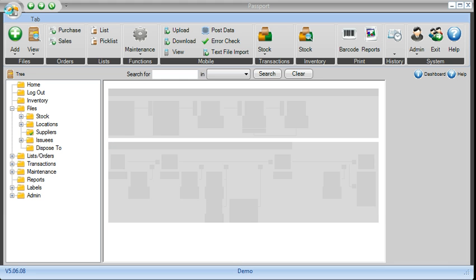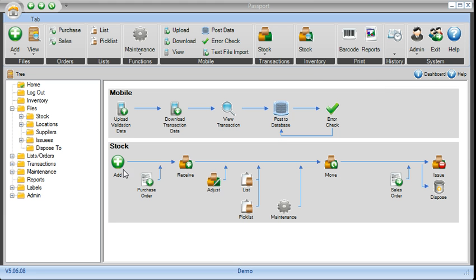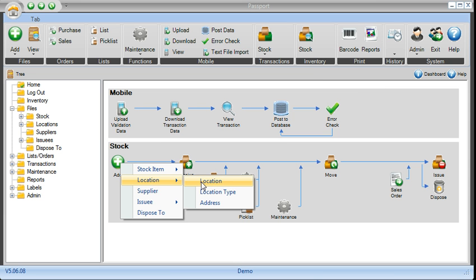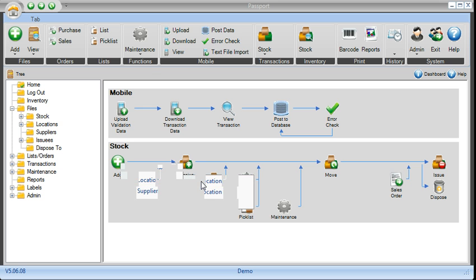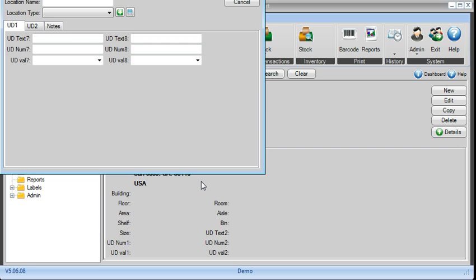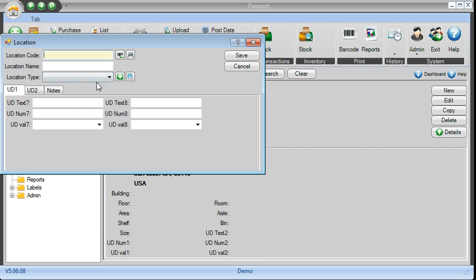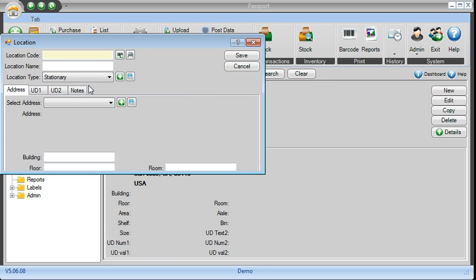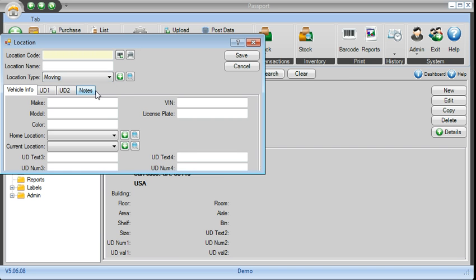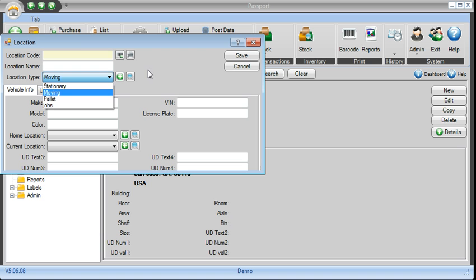In addition, once you create all the suppliers, you create all the locations where you can store these specimens, and these locations could be anything from fixed locations to moving locations to anything that you designate.